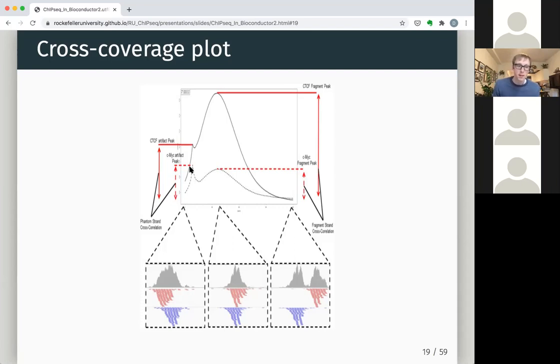These are low complexity peaks that are essentially just usually sometimes single reads either stacked on top of each other or the absence of a read there. If it's a place that can't be mapped, will also produce this. But because it's just a bunch of reads stacked on top of each other, the correlation is just going to be the length of your fragment, or the length of your sequencing read as opposed to the length of your fragment.